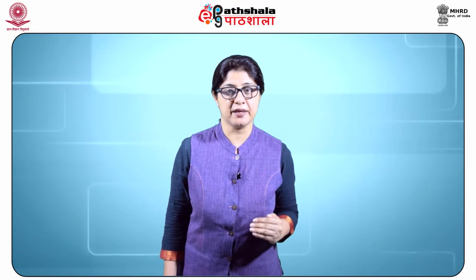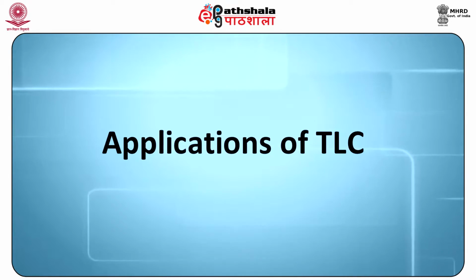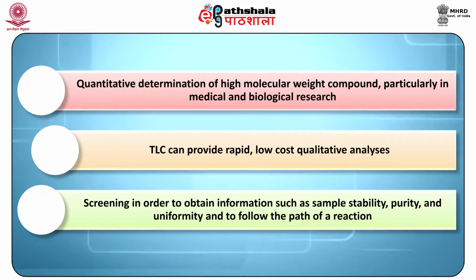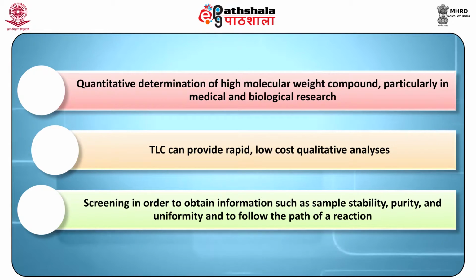Quantitative analysis can be performed directly on the TLC plate itself, or after removing the substance from the TLC plate and then determined after elution, which is also called an indirect method. Applications of TLC. Quantitative determination of high molecular weight compounds, particularly in medical and biological research. TLC can provide rapid, low-cost qualitative analysis and screening in order to obtain information such as sample stability, purity and uniformity, and to follow the path of a reaction.